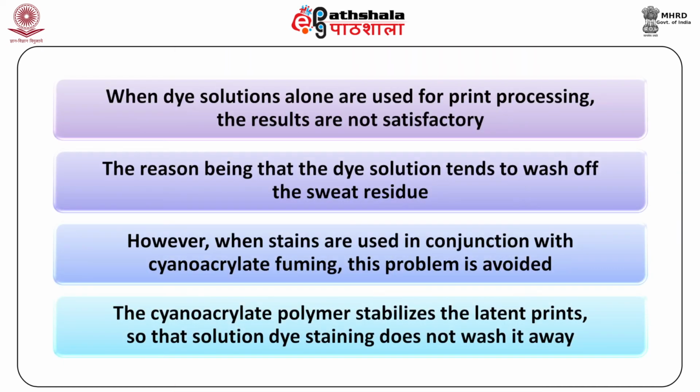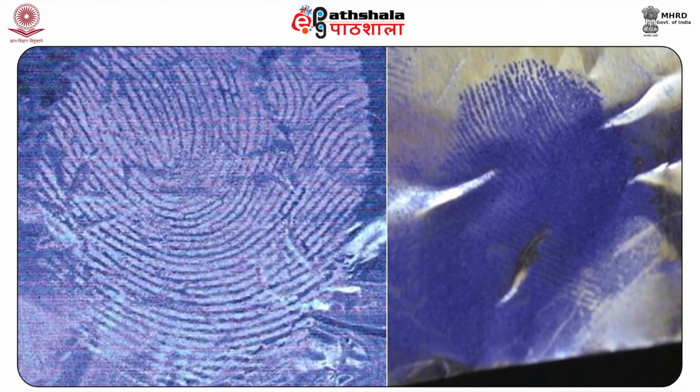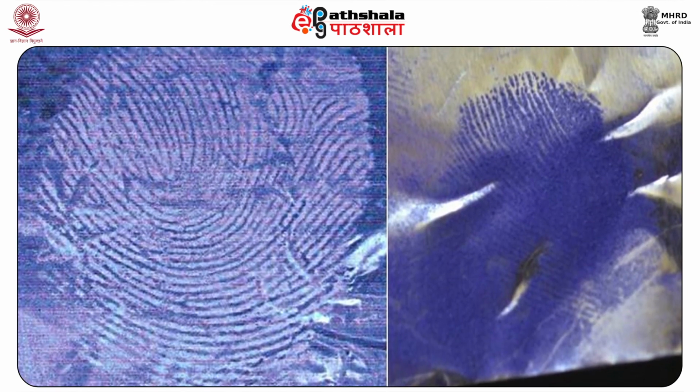When dye solutions alone are used for print processing, the results are not satisfactory, the reason being that the dye solution tends to wash off the sweat residue. However, when stains are used in conjunction with cyanoacrylate fuming, this problem is avoided. The cyanoacrylate polymer stabilizes the latent prints so that solution dye staining does not wash it away. Crystal violet improves the contrast of weak prints developed on polythene by the cyanoacrylate method.